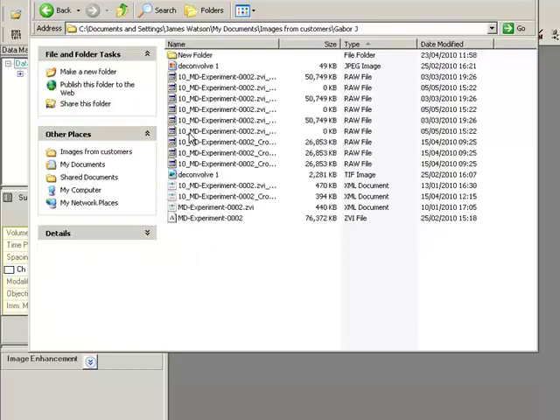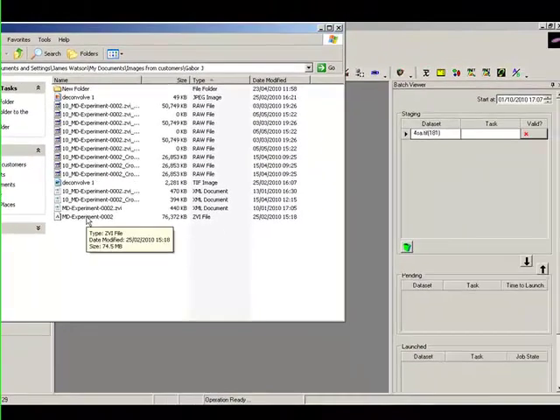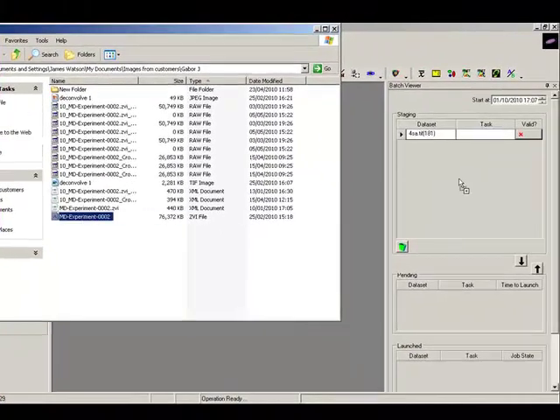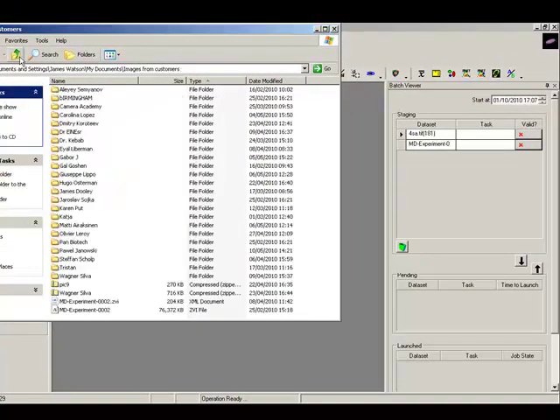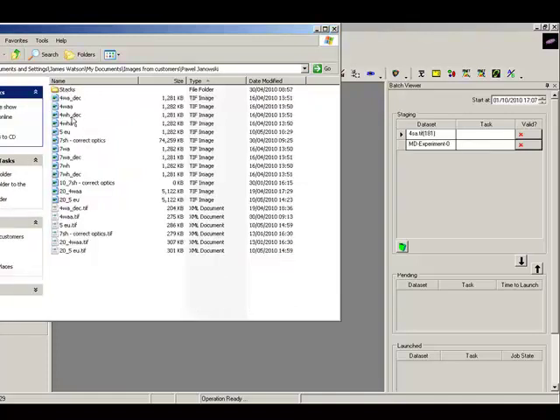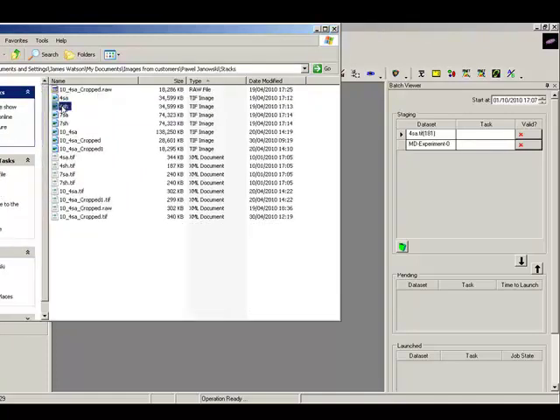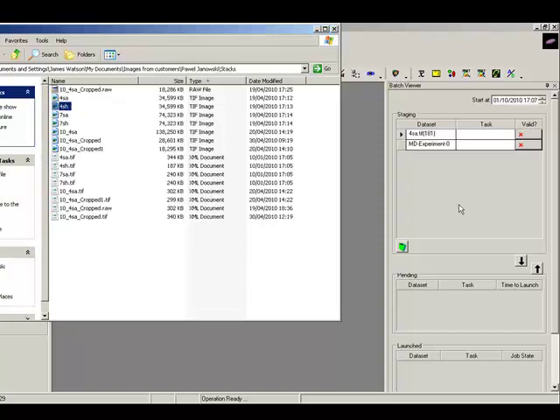So I'm going to add this one here. I'm just going to simply drag and drop like so. And I'll add another one, like that.